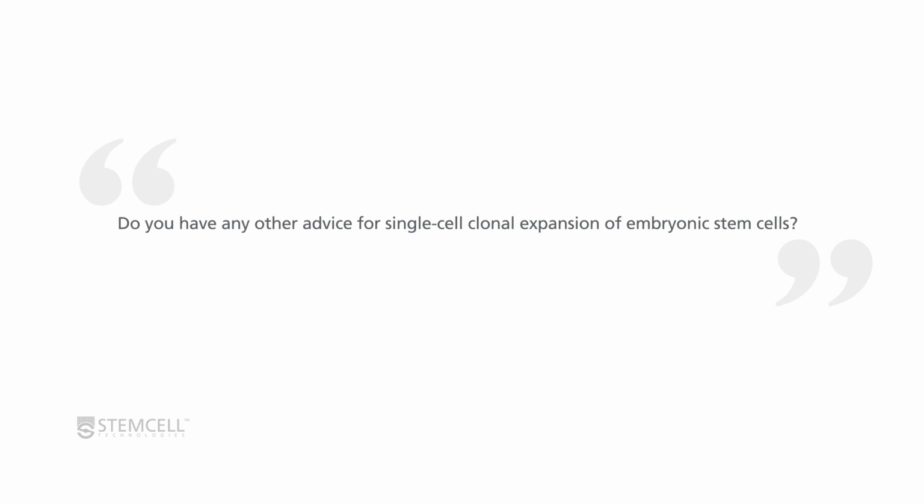So I don't think there's any way to perform single cell cloning in PSCs without using some sort of supplement to support survival of those single cells.